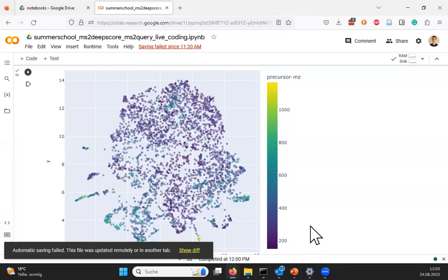And I think it's good if we switch to the presentation from Justin. Then I will go back to this notebook, so you can leave it open, and show you how we import data into these notebooks and how we then use it to color these dots.